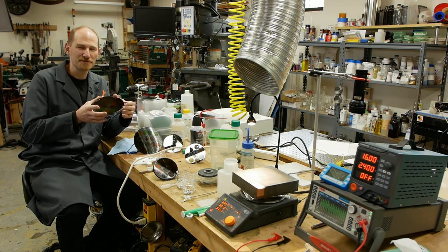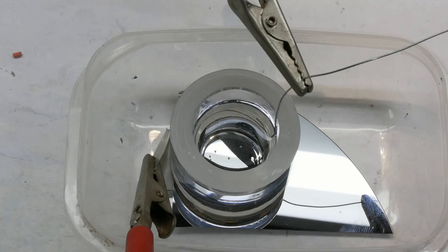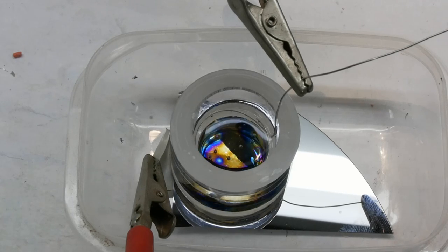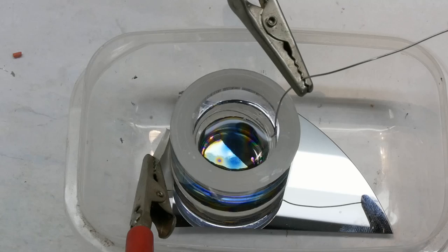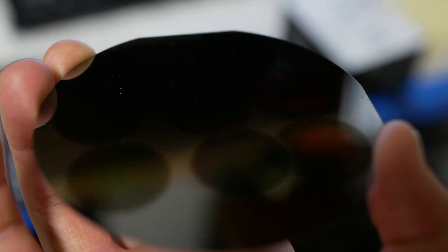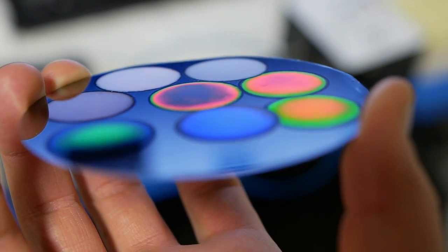Today on Applied Science, I'd like to show you a technique to etch silicon wafers to make optical filters. These are the same wafers that are used to make integrated circuits, but in today's experiment we're going to use an acid bath and an electrical current to make these specialized optical rugate filters.